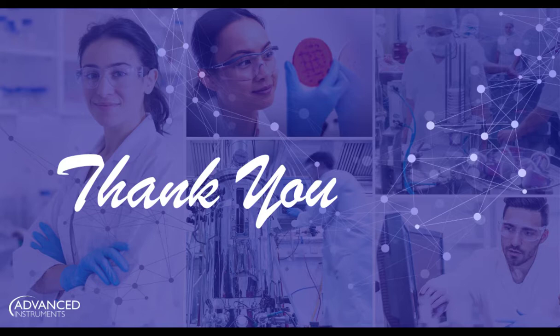Right, and I think to your point earlier, the focus shifts from the health of the cell, making sure that you have productive cells and a great yield coming out of your upstream process, to the downstream, where, as we showed you, you are looking at your buffers, which are now interacting with your drug substance and the proteins. The focus shifts on where you may be looking at osmolality.